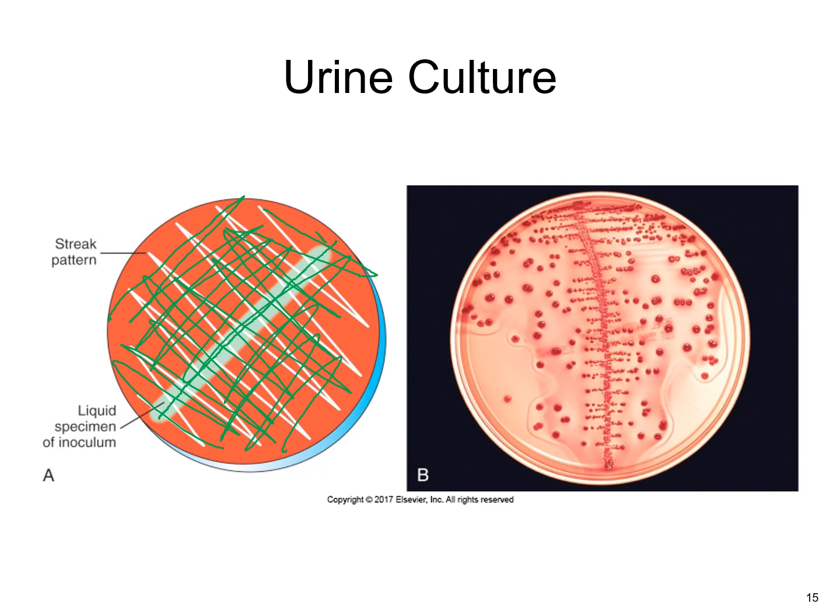And so you can see here where these organisms have grown out, and you have individual colonies. So you would actually count or do an estimate of these colonies. So if I were looking at this, I would get a picture of about 5, what they look like. So I would say 5, 10, 15, 20, 25, 30, 35. But there's many small ones there. So you're looking at greater than 100. So I wouldn't sit and count every colony. I would just kind of give an estimate. And so this is something that you will get used to over time.